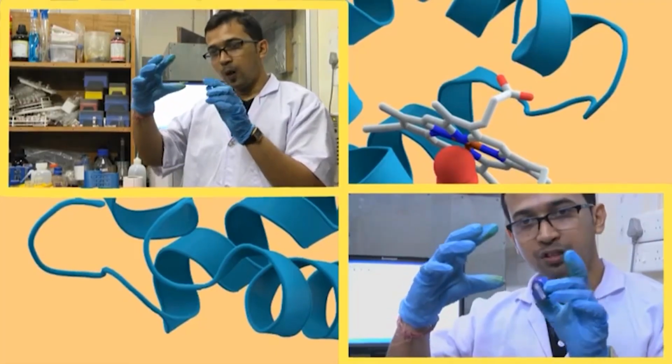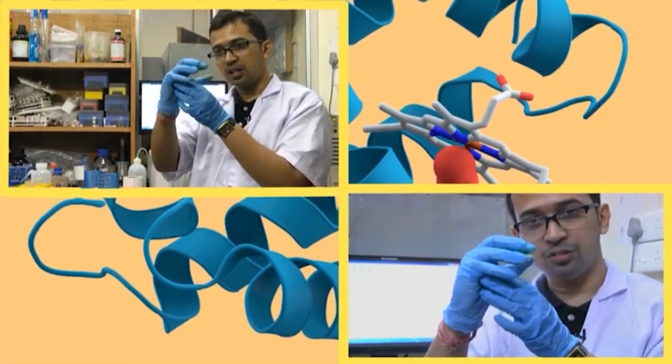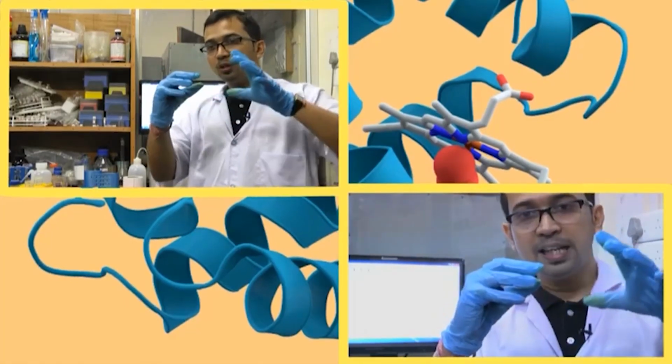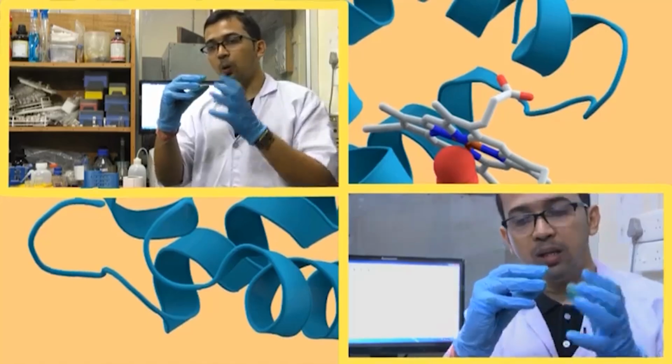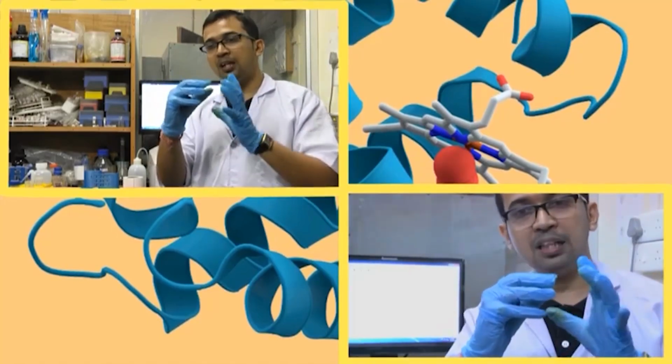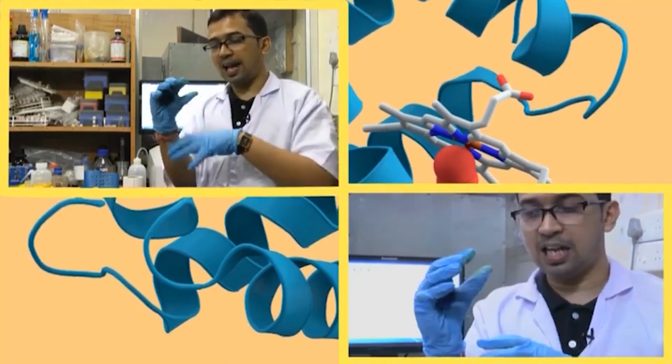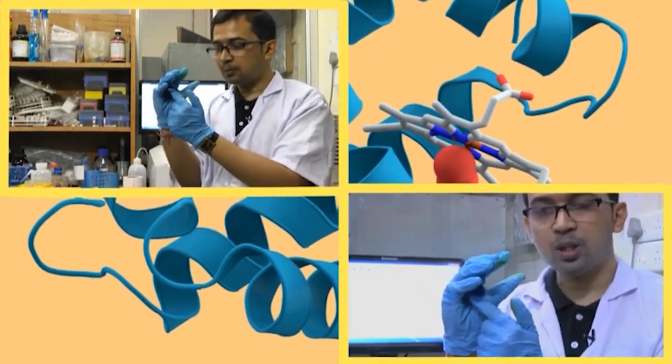Once it is attaching in this way, here you can only see my hand. So the incident light is only seeing the protein molecule. It is no longer seeing the gallic acid, or it is seeing it, but at a much lower extent.